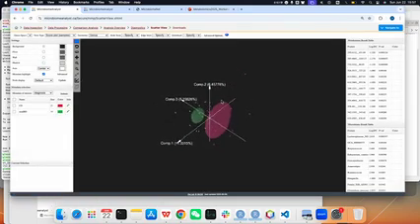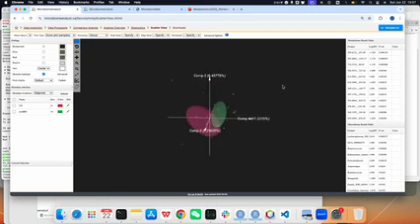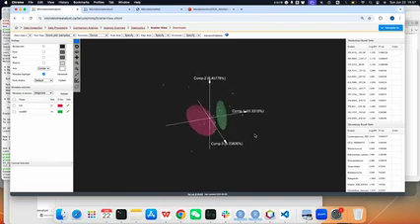So you can see it looks like the two groups through Diablo kind of separate, which means even though it's not quite dominant, the interaction between microbiome and metabolomics, to a certain degree, can help to distinguish between the groups. So this is the result for Diablo. You have similar visualization, and you can explore.